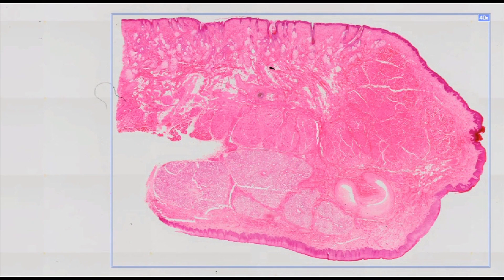The lip H&E staining: a sagittal section through the lip stained with a routine histological staining method, hematoxylin and eosin. The lip is a fold of the mouth wall covered with skin on the outside and with oral mucosa on the inside. Between them there are bundles of muscle fibers that make up the orbicularis oris muscle.